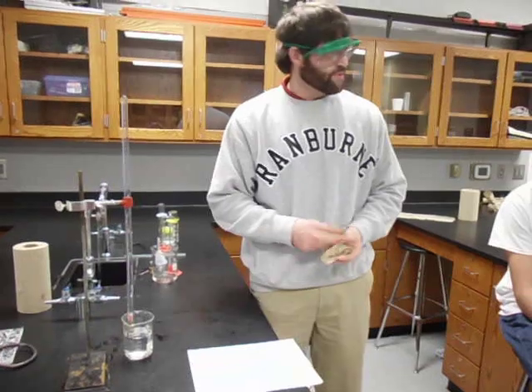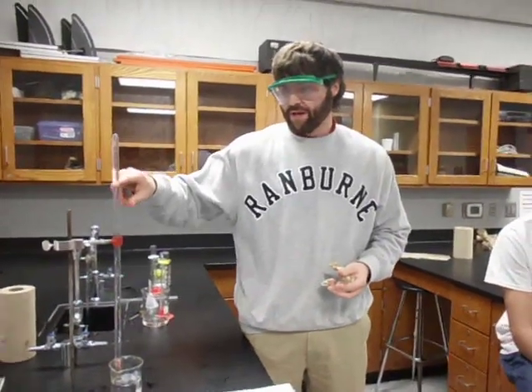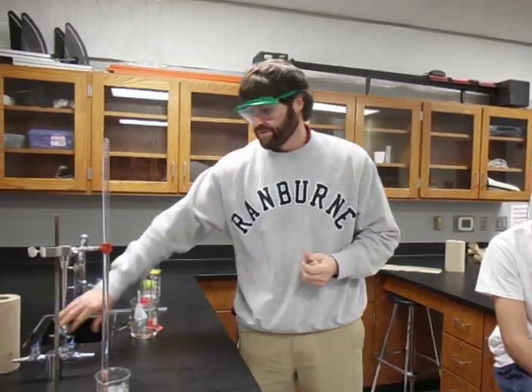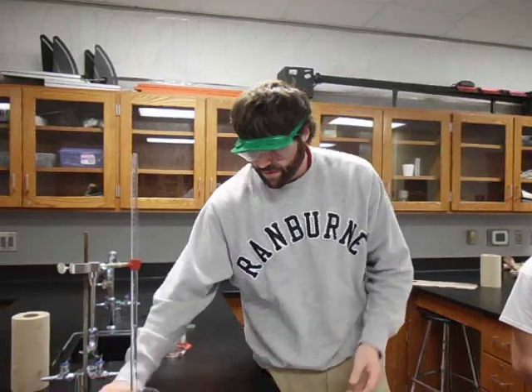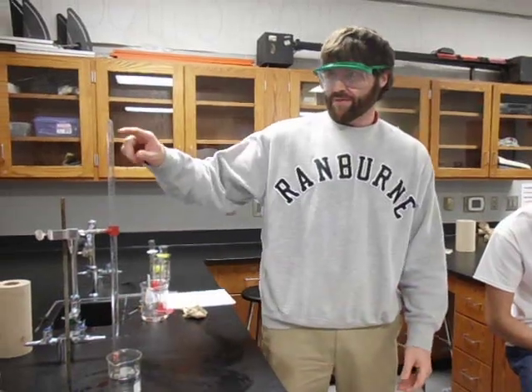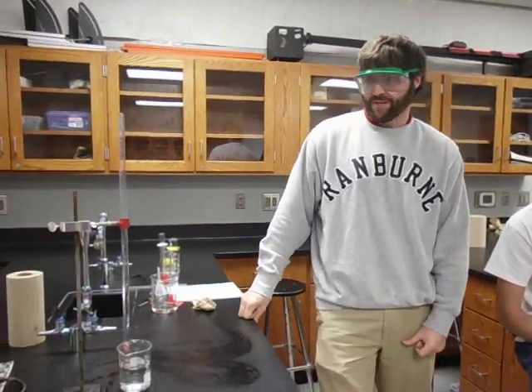When you get done, all the acid is pretty weak — just wash everything off really well and dry it before you put it back in your drawers. Clean everything else up, and leave this sitting here until tomorrow. The next day, come back in and just read the volume on the eudiometer — that's it. It's only 0.1 molar acid solution, so pour everything down the sink and run lots of water through to clean up. No need for baking soda. Eventually it will be full of hydrogen gas at the top.